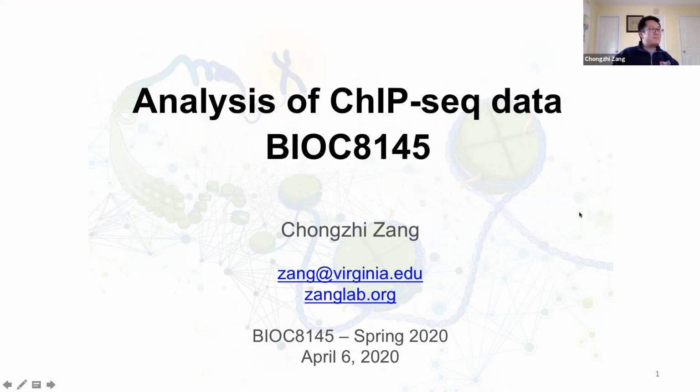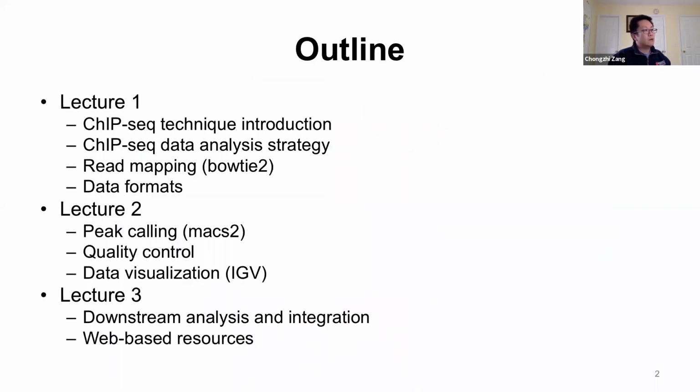Anyway, in the last 2 weeks, Stefan already gave us a very comprehensive overview about some statistics and some models for sequencing data analysis, as well as some very useful hands-on analysis tools for R and Unix. So my plan this week is to give you an overview about ChIP-seq data analysis.